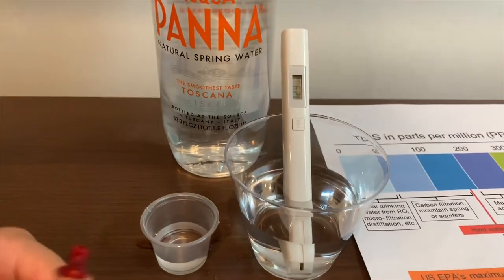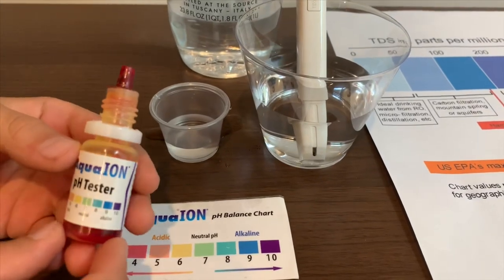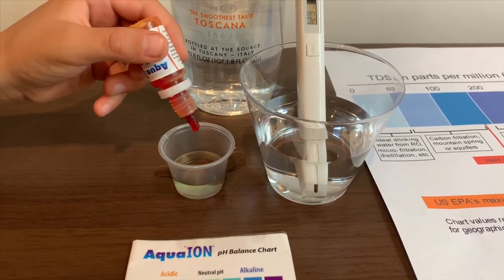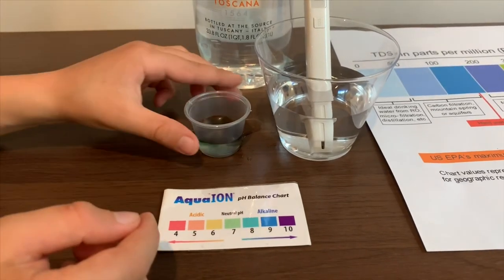Now let's test the pH. If you want to buy this pH tester, check the link down below. Only do two drops. Let's stir it a little.